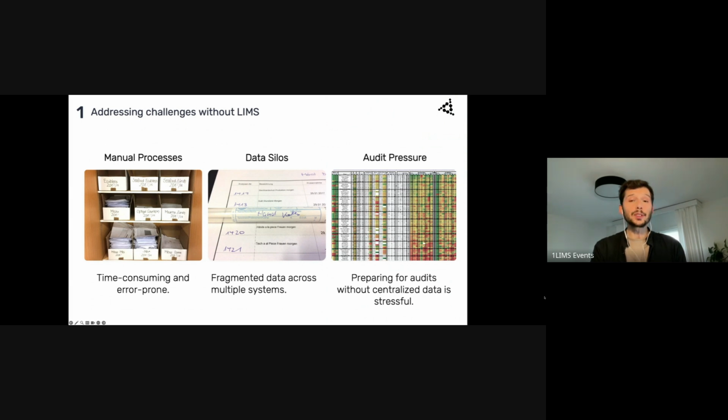How can a LIMS help here? This is a good question because it supports lab technicians and scientists on a daily basis. In the first place, it can automatically assign unique sample IDs, for example, for full traceability. You can use QR codes or barcodes, scanning to prevent mislabeling and data loss, or even track each sample's journey from registration to reporting.